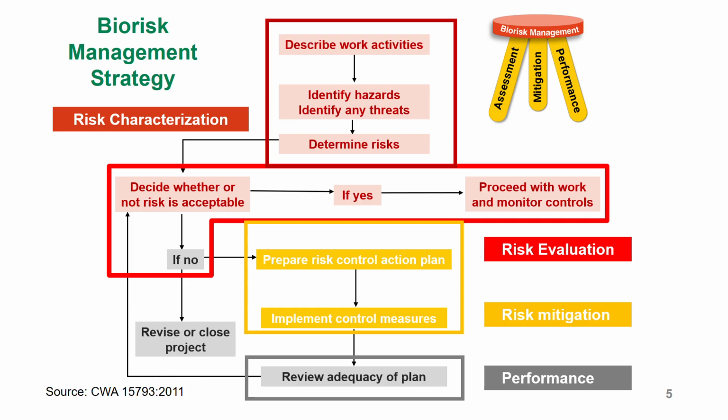Then another way you can revise is if you are doing culture for a certain test. Let me give another example. If you're doing culture for cholera, at this particular point, you may try to review the procedure itself entirely. So you may just decide to say, okay, we cannot really reduce the risk of us culturing, let's say, cholera in our lab. The risk is too high. Therefore, we won't culture the samples. We'll start doing some form of serological test.